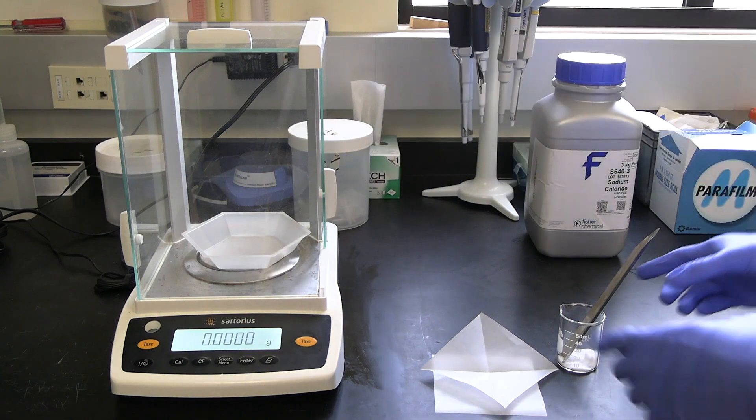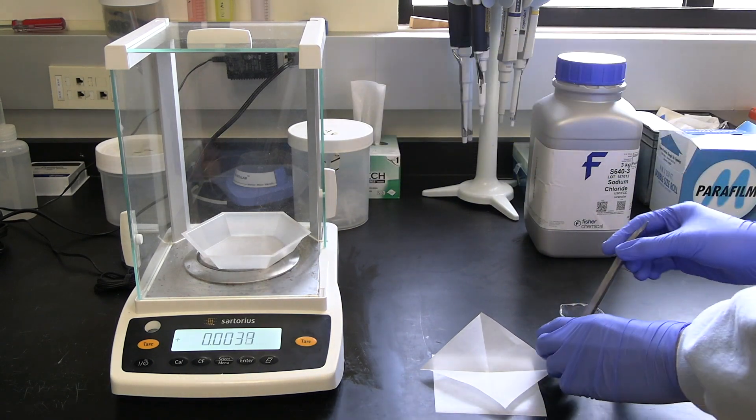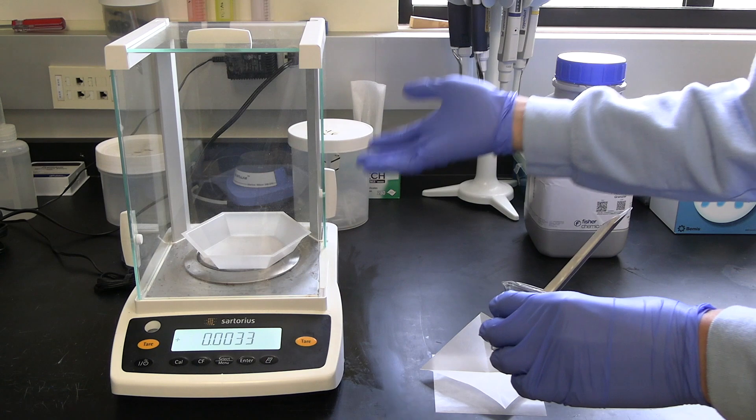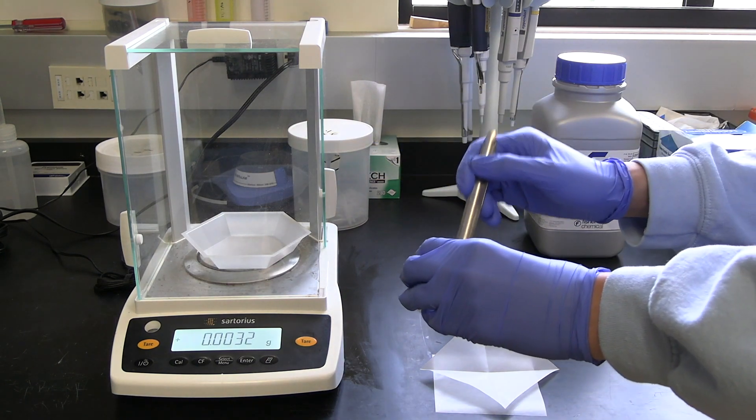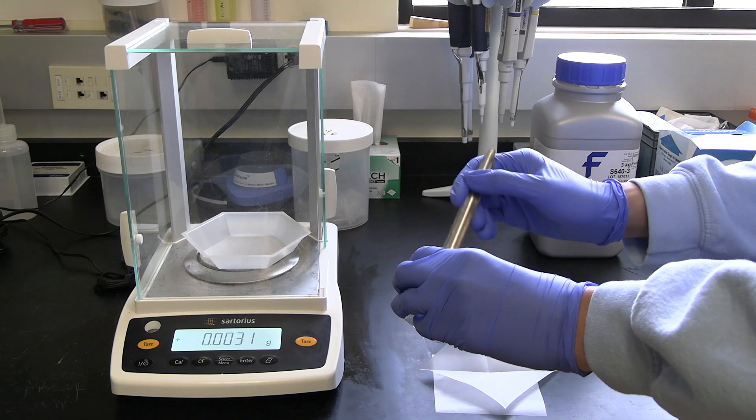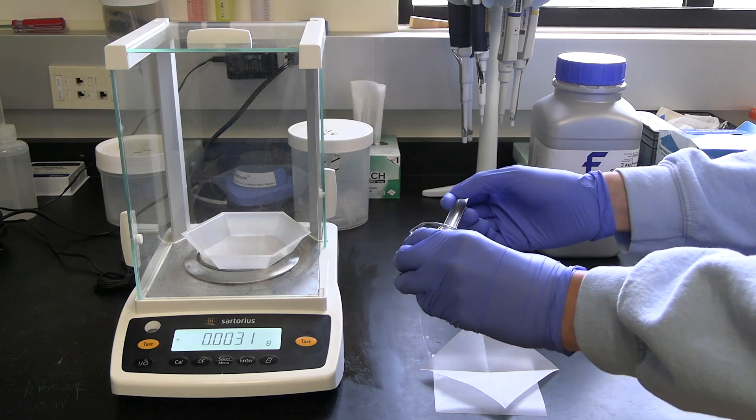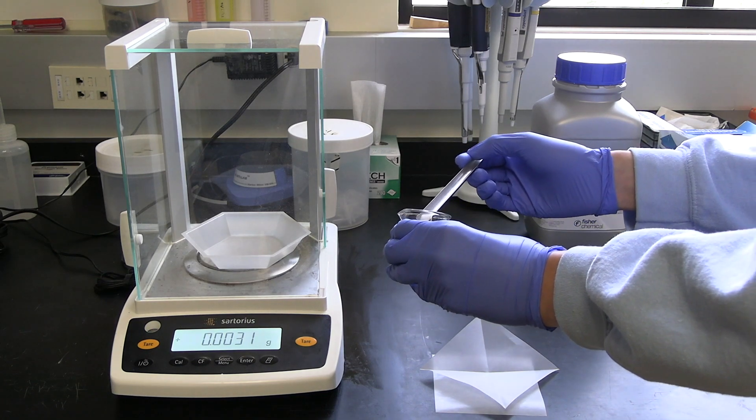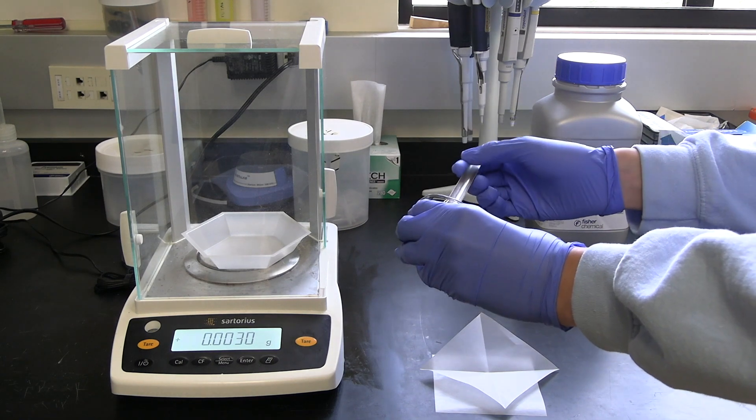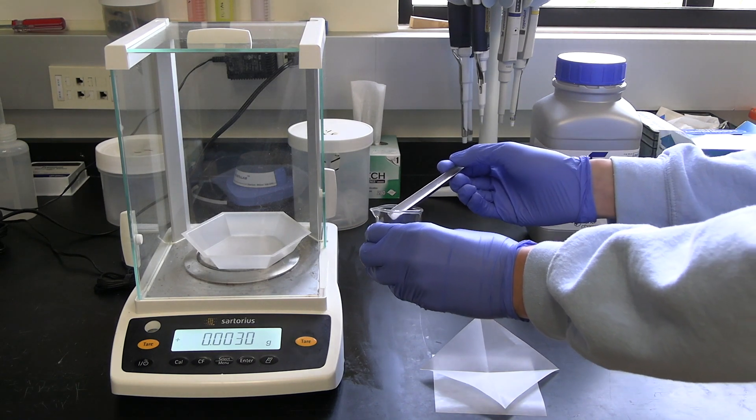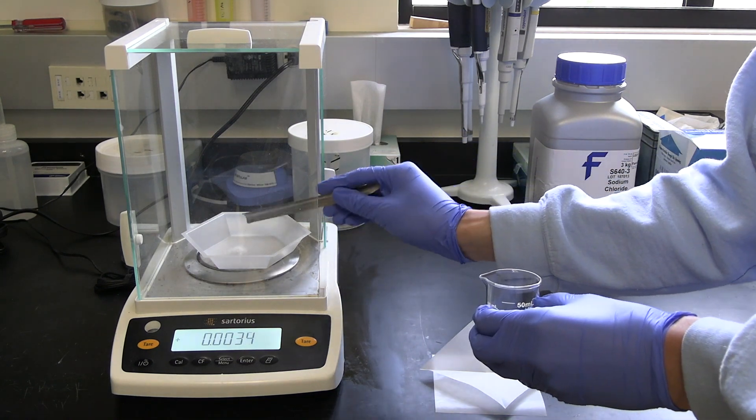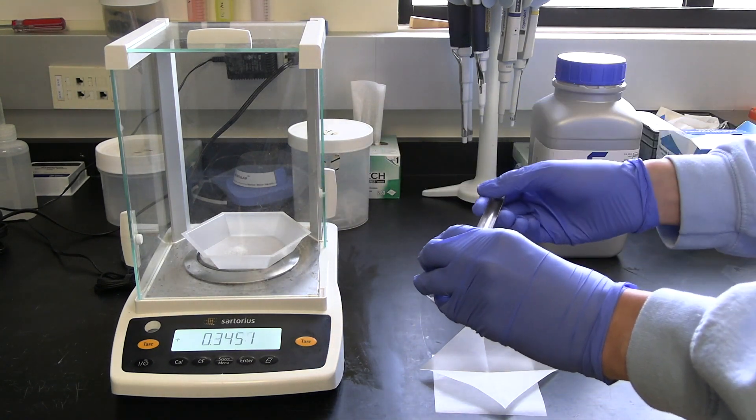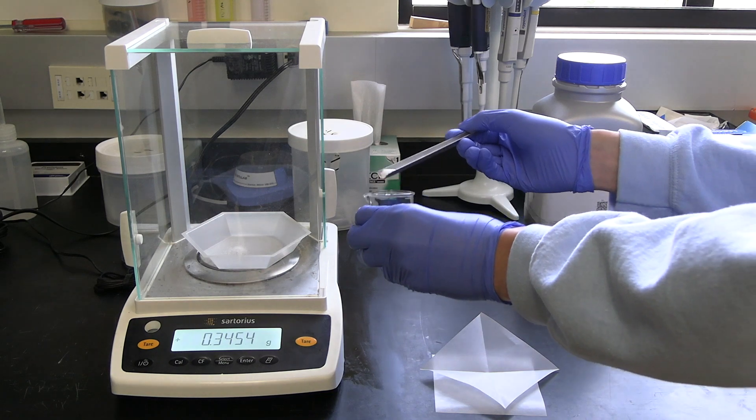And so once that's done, we can reopen up one of these doors. And do make sure the door is closed when you're doing the weighing. It will affect the measurement. Just breaking up some of the salt pieces. And then we're going to just put an arbitrary amount of salt into our weigh boat, making sure not to spill any outside of the weigh boat.